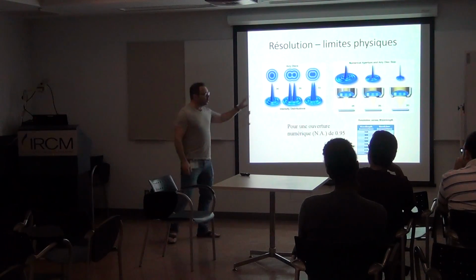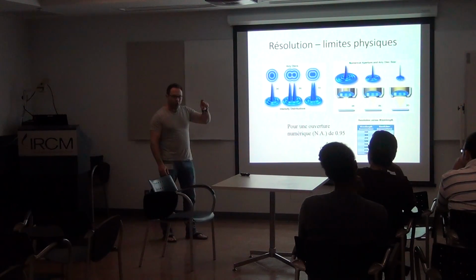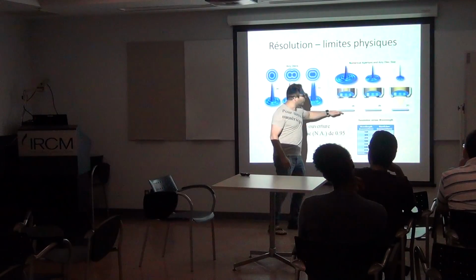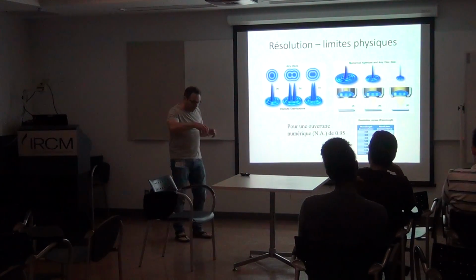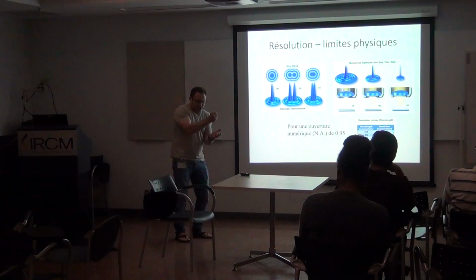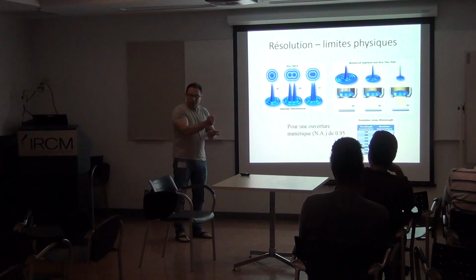In an objective, everything is fixed. And when you use a microscope objective, the focus is always at a certain distance from the surface of it. So if I make the focus with an objective, I just bring the objective to the right position where the focus is, and then I see the object correctly.